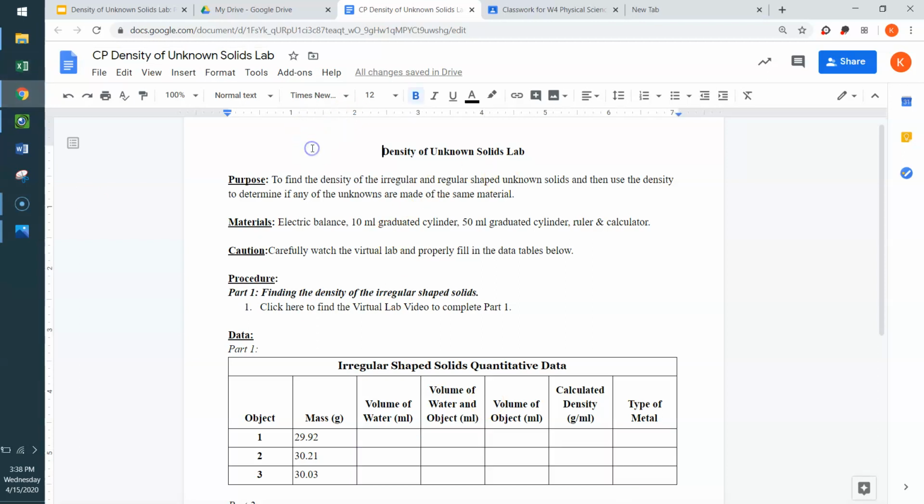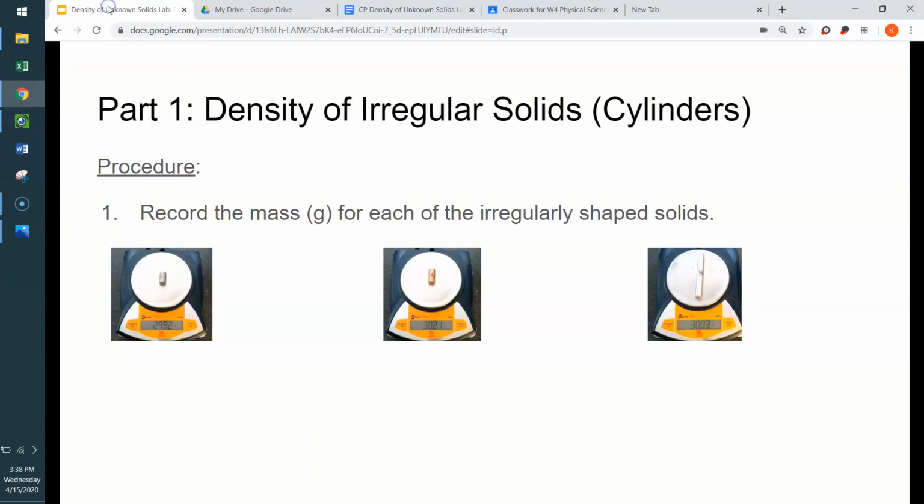Okay. Once you get your data typed in, let's highlight this whole data set and just go up here to the center justification, center alignment, and click that, and now it is nice and neat, and every other cell should be just like that. Okay, back to the actual lab.